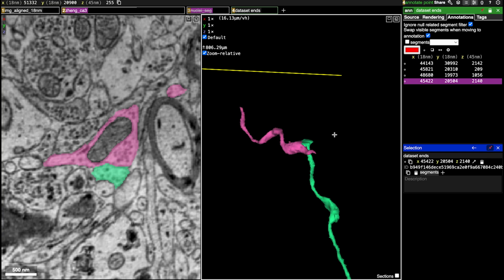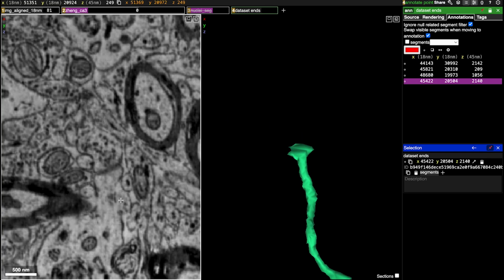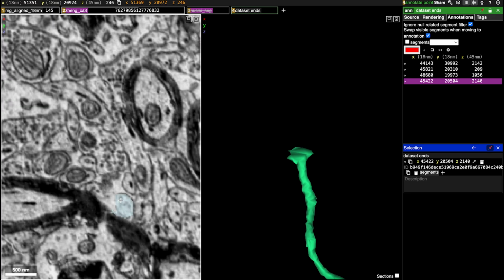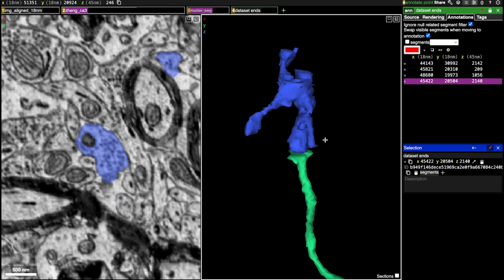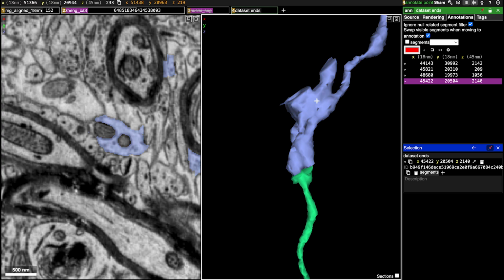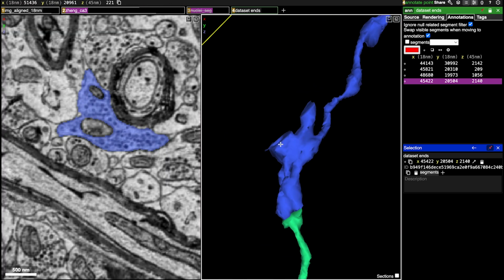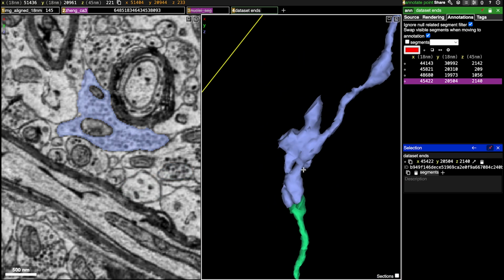It looks like it did. And I'm just gonna get rid of the merger piece. And then we're gonna see if we can find an extension on this, which it looks like we can, but it looks like we've got another little merger right up here. So I'm gonna have to get rid of that as well.